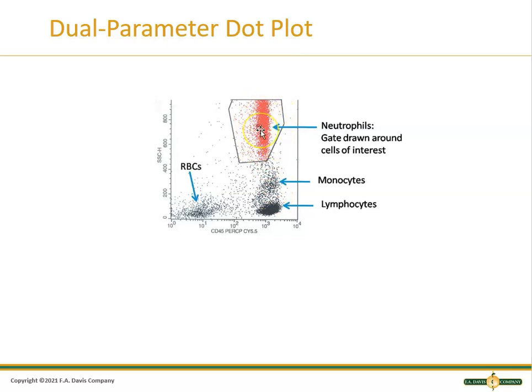So what they've done is they've put a gate around it, like a fence. They call it gating. That's the term they use for that. So they're surrounding, we'll say. So they're saying everything in this gated area is neutrophils. So that's what the gating is doing. So we can say, this is what we're after. I want you to enumerate those and tell me what that is. Okay?